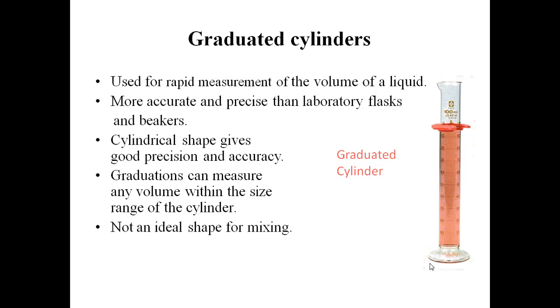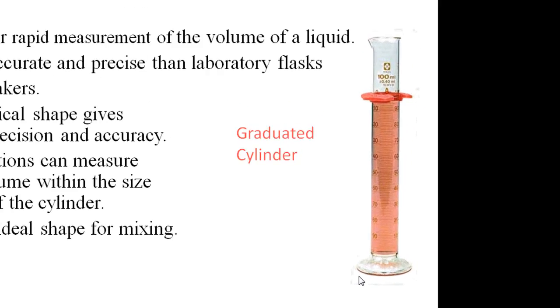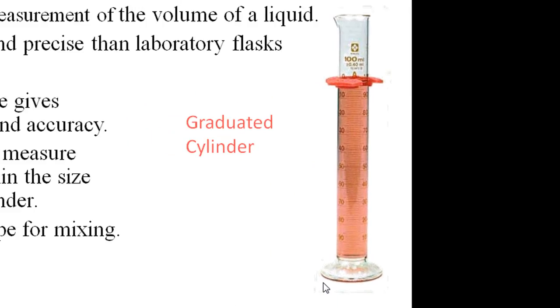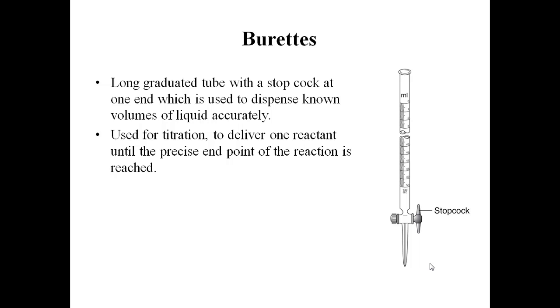It has a cylindrical shape which gives good precision and accuracy. Graduation can measure any volume within the size range of the cylinder, but it is not an ideal shape for mixing. This is not used for mixing purposes.